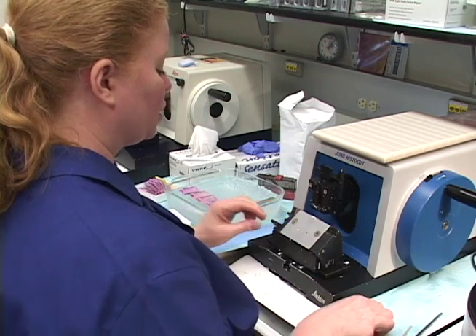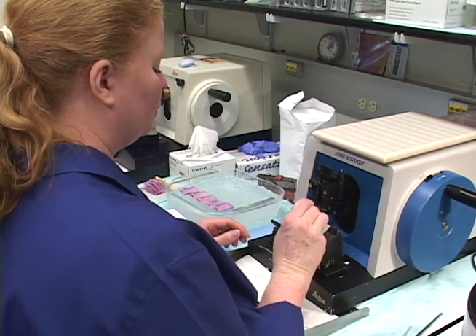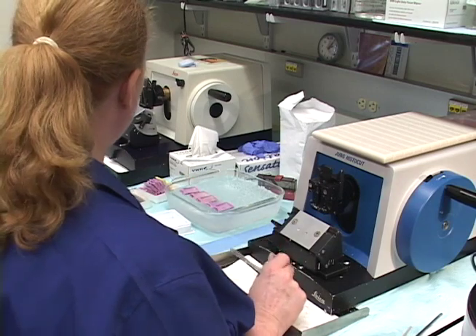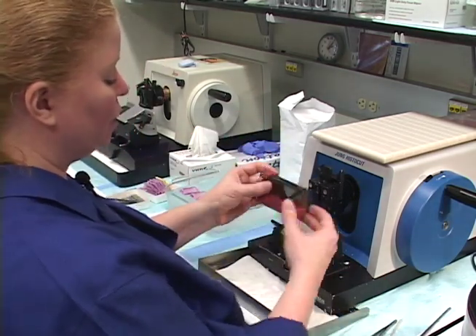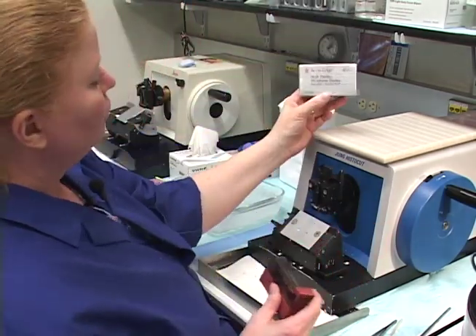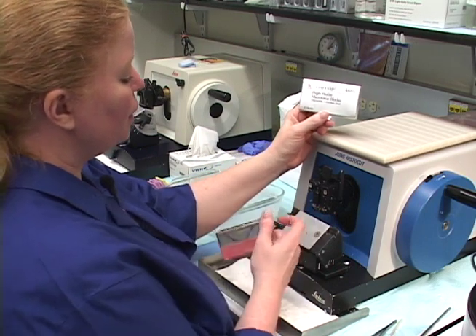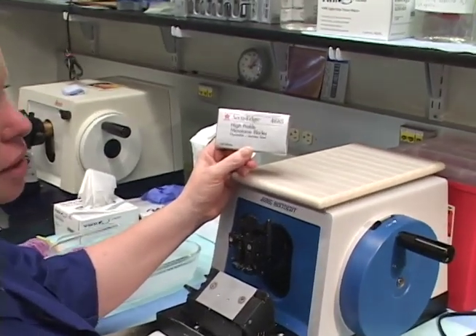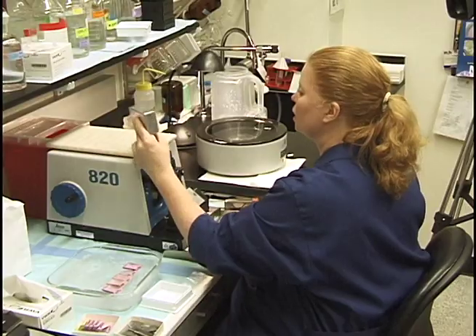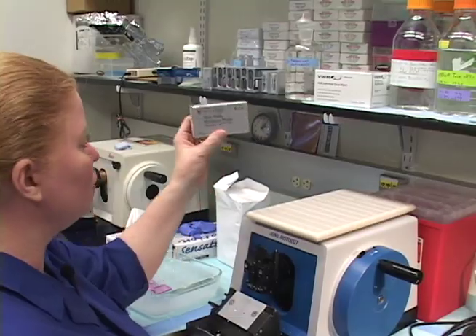Let's put a fresh blade in. I'm going to save the previous blade since it was fresh and only used for a quick facing. I use AccuEdge high-profile blades on this microtome — this brand works very nicely. Another brand I recommend is the Sturkey blade, used by the Awatwami lab, which is especially nice for cryo-sectioning.